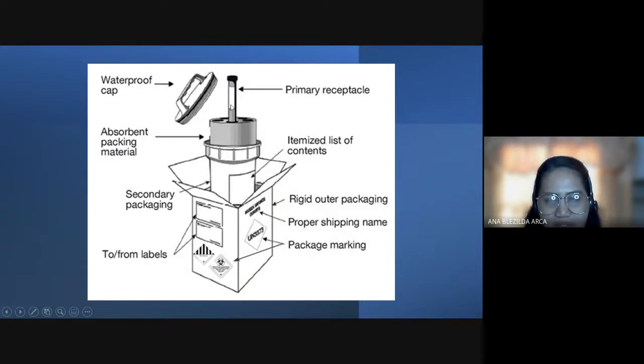And then, the primary receptacle or the test tube. So, hindi lang basta-basta na binalot mo lang yung test tube, pinadala mo sa Amerika, hindi gano'n. Dapat meron siyang mga label, 'yan. Packaging na secondary na canister, 'di ba? Meron kang foam dito na absorbent, and then meron kang test tube na plastic na hindi talaga mababasag, and of course, the waterproof cap.